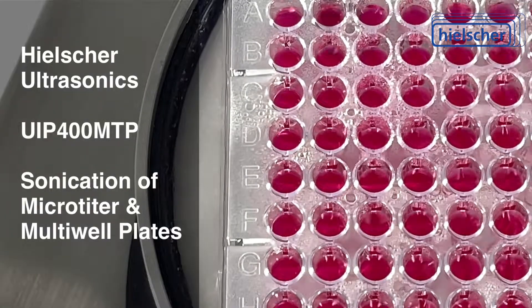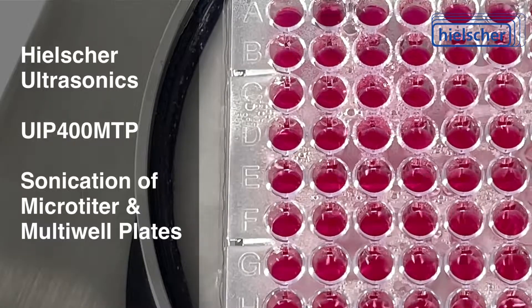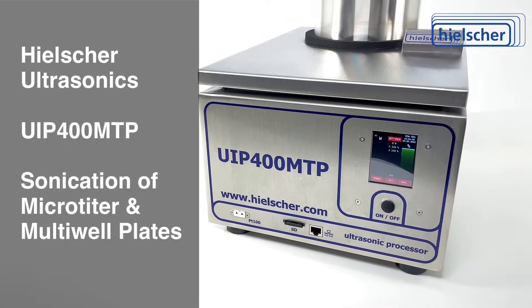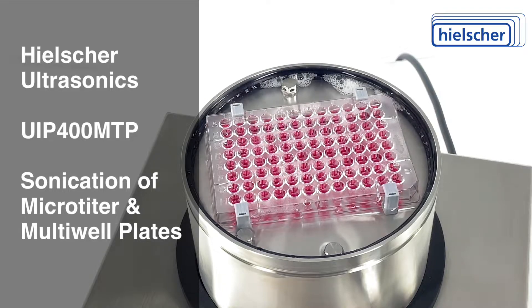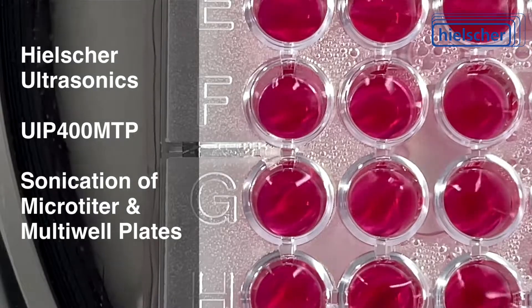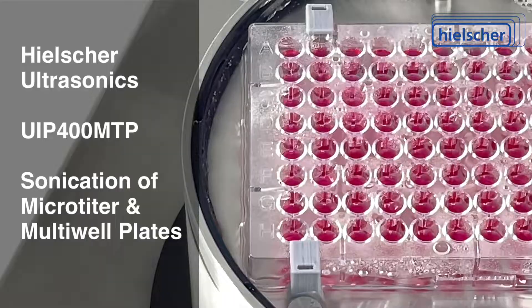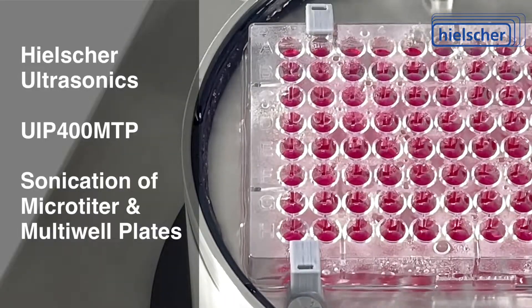Analytical laboratories and research facilities appreciate its high result uniformity and ease of use. The technologically advanced design of the UIP-400 MTP transmits ultrasonic vibrations to every well in the plate with the highest possible uniformity of ultrasonic intensity. This leads to identical sonication results in all wells. The water under the microplate couples the ultrasonic energy and cools the sample temperature during sonication.